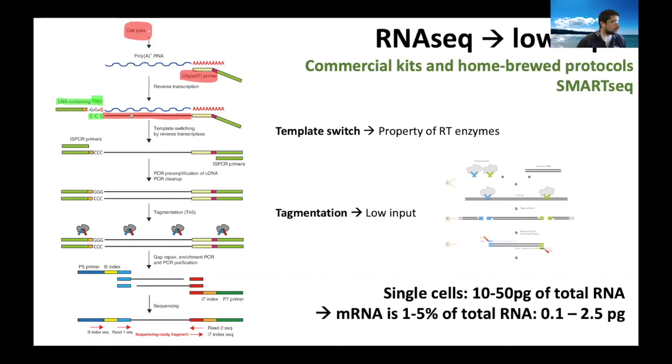Up to here it was doing reverse transcription from an RNA substrate. It switches, that's the origin of the word switch. It switches template type. The TSO oligo is a DNA oligo.